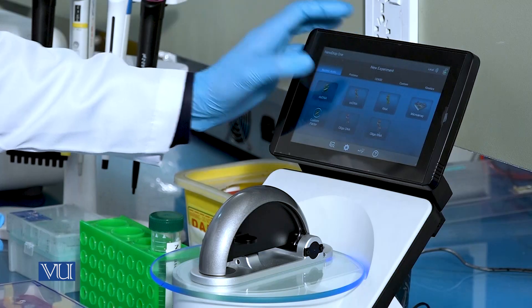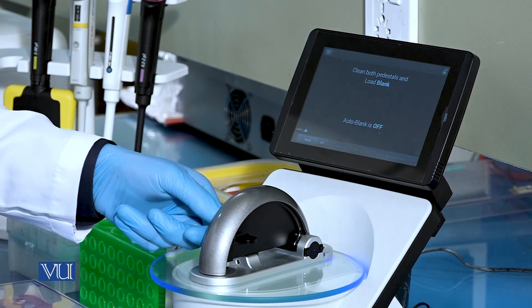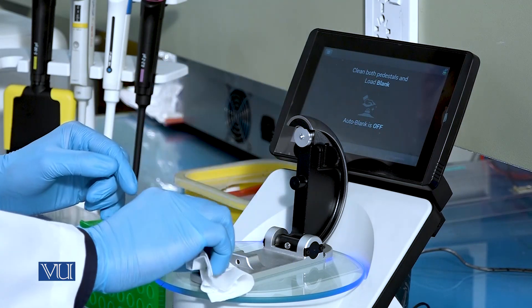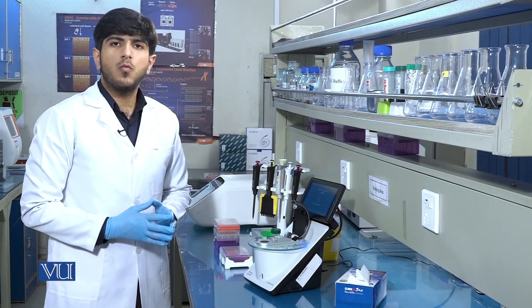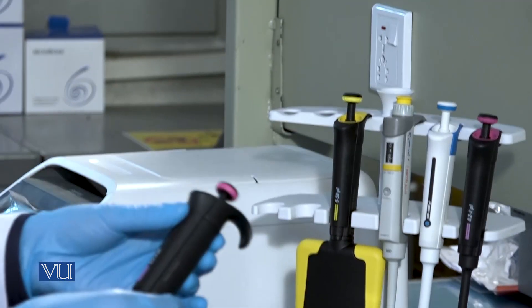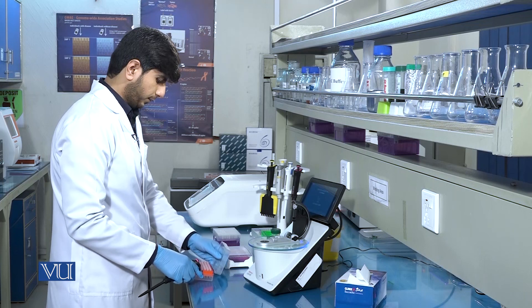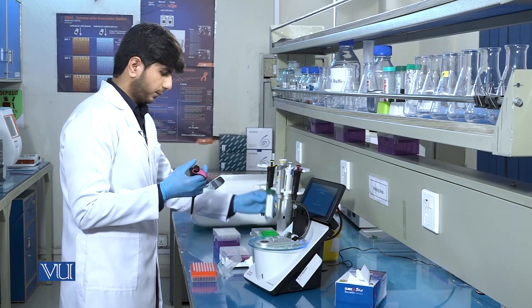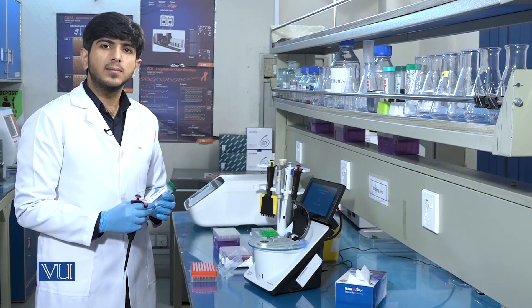When we click on double-stranded DNA, it will prompt us to load the blank sample. We will open the paddle of the NanoDrop and clean both tips carefully. After cleaning the tips, we will load the blank sample, which is 1 µL of nuclease-free water, and use it to blank the instrument.